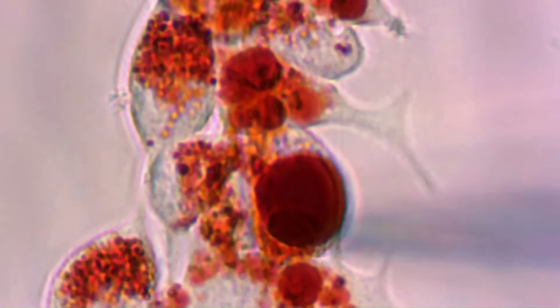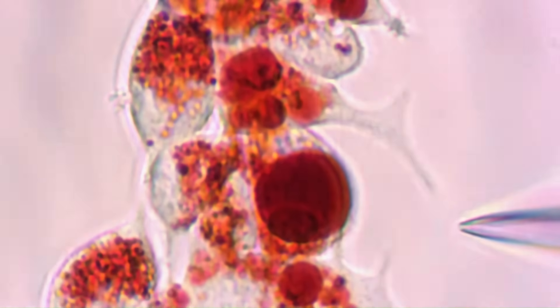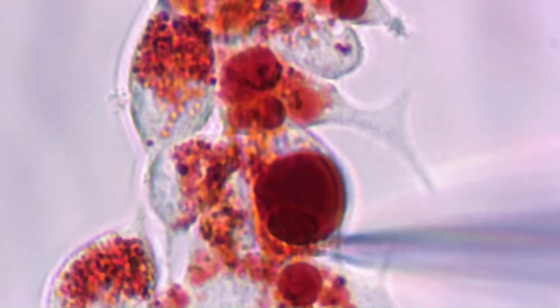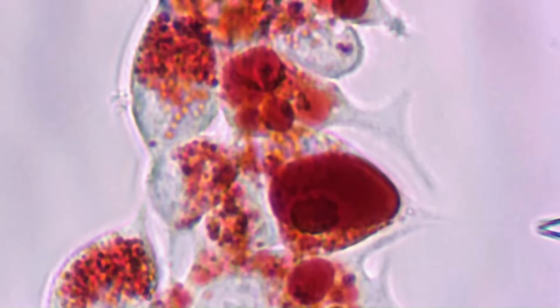Then, as you will have just seen in the video, the coverslip is scanned for a lysosome that is suitable to extract. A suitable lysosome is one that is larger than the diameter of the pipette tip and is found close to the edge of a cell so that it can be easily extracted and patched.